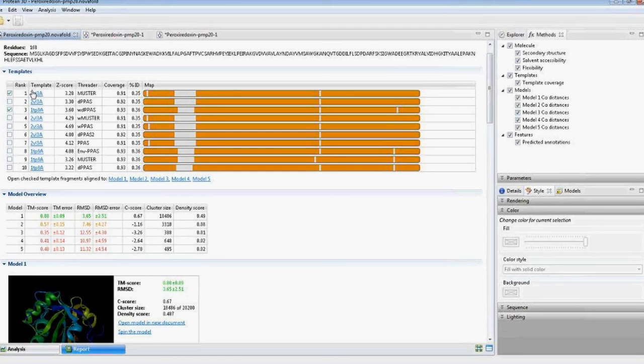Okay, great, thank you. Can features such as disulfide bonds be specified? Yes, definitely. This is another one of the user restraint controls that we're offering in NovaFold Local. Atomic distances within the query protein can be specified as part of your prediction setup, much like defining your own template structure.